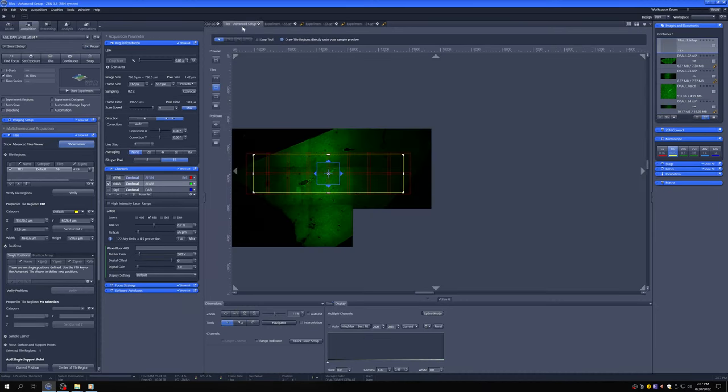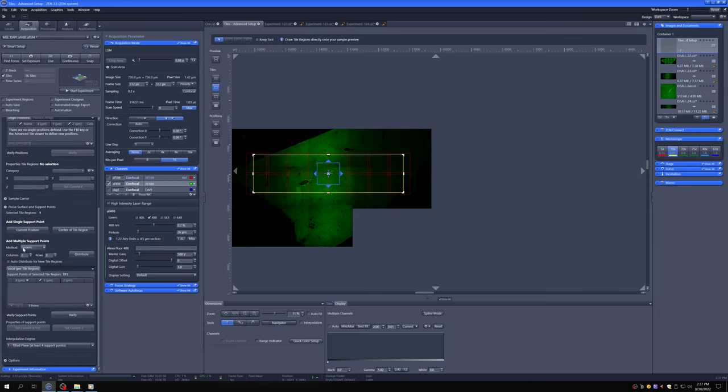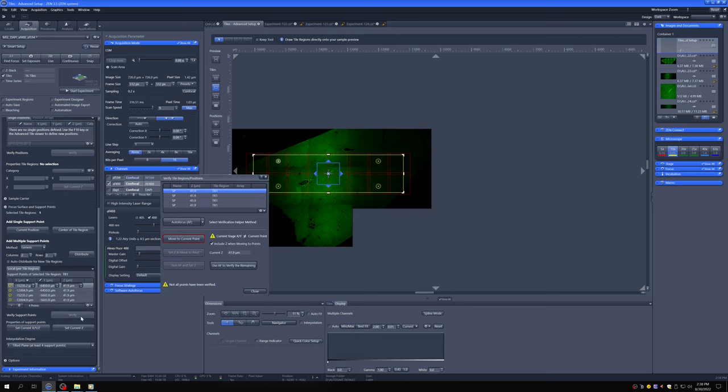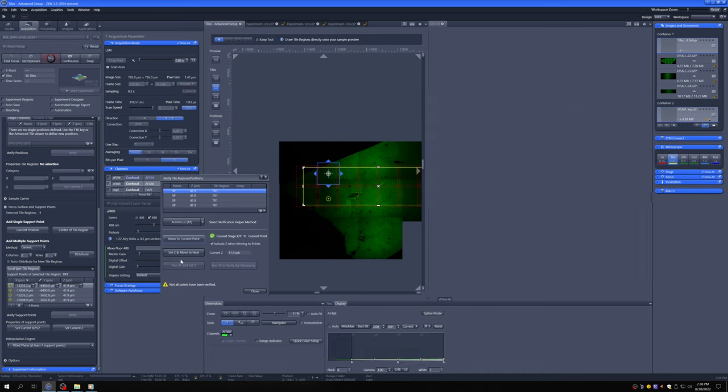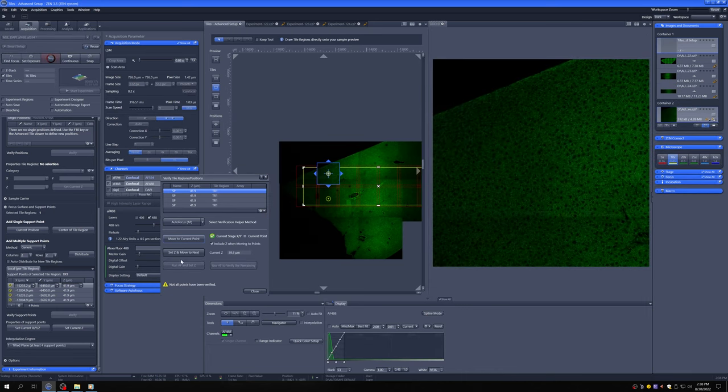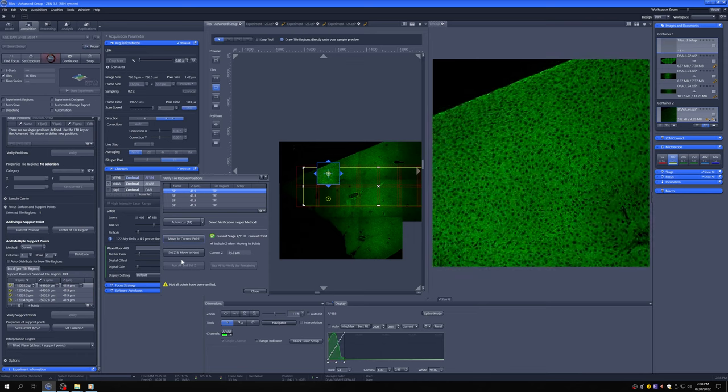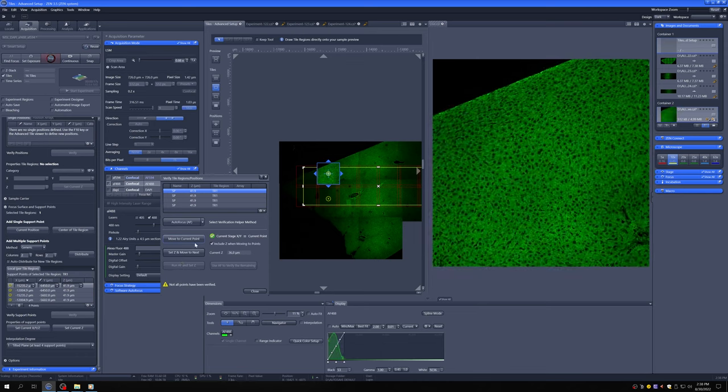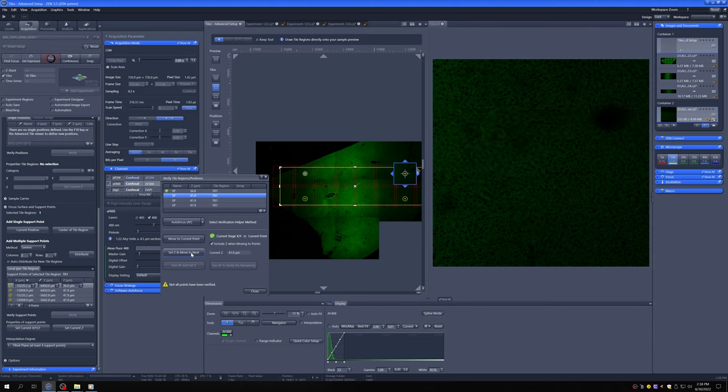What we can do is we go back here and we have this method generic and we distribute the points. These are going to be these points where it checks the focus. So now if we go to this one and say verify, I'm going to move to the current point. It goes there. We go to live and we adjust the focus by hand until this is as bright as it can be. And we say set Z and move to next.